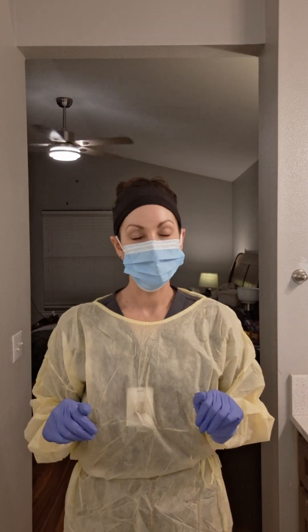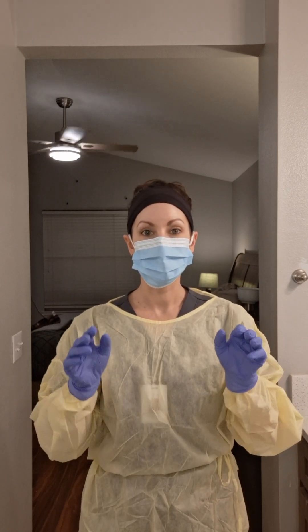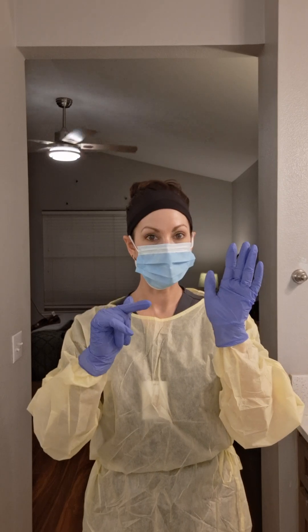Now I'm ready to enter the patient's room. I'm done with my patient and I'm getting ready to exit. Before I exit, I doff my PPE, starting with my gloves.